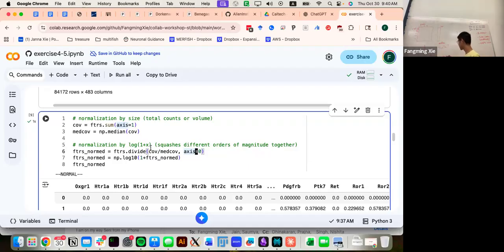Very few cells have very high counts, up to 500. If you directly use these features for algorithms like PCA and UMAP, if all the genes are like this, the algorithm usually doesn't like that. A few outliers can influence the mean value a lot.